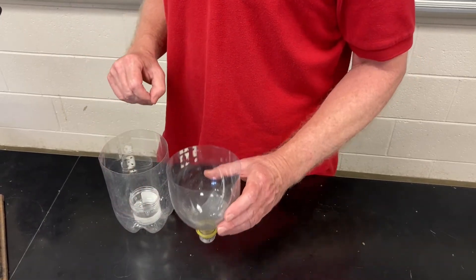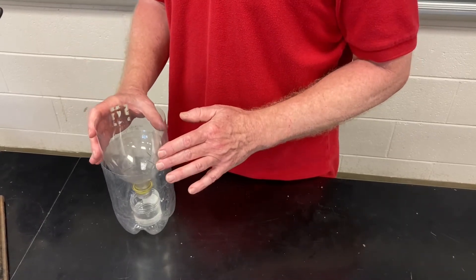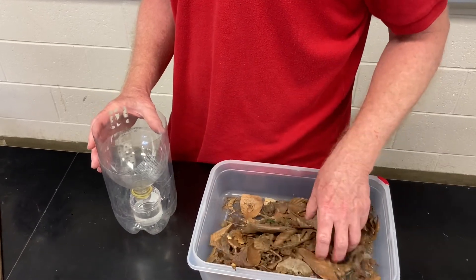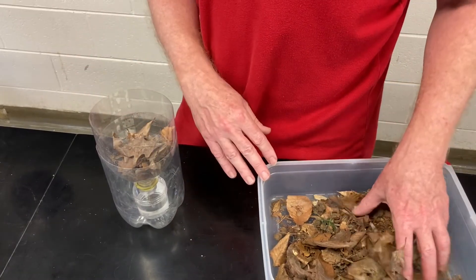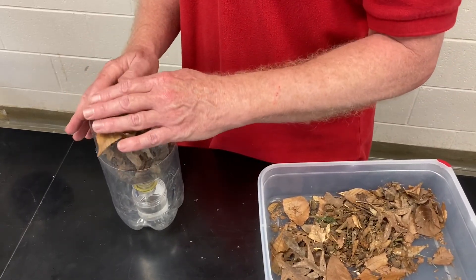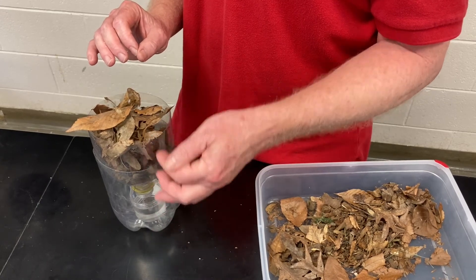I'm going to take this top part of the funnel and put it in here, and then I've collected some material. You want to carefully place it inside the funnel. You don't want to pack it too tightly because you want the small arthropods to be able to move freely up and down in this sample.